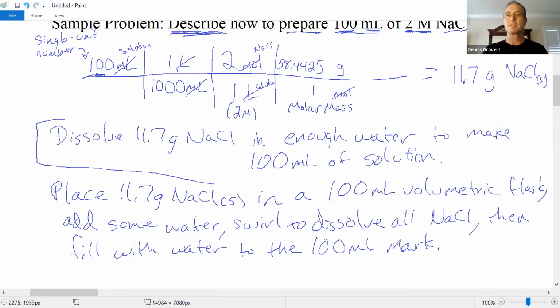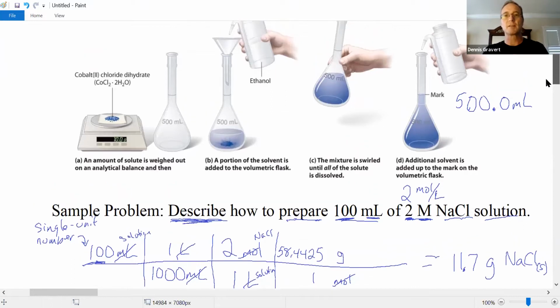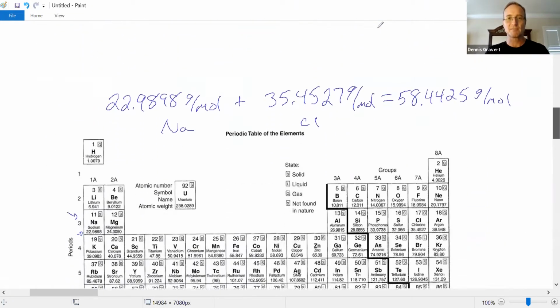Someone else might like that much detail. And all we're doing is just explaining this process we got right up here. And we supplied the actual quantity of the weight we need of the crystals. Okay. One thing done in the video, we've prepared a solution.